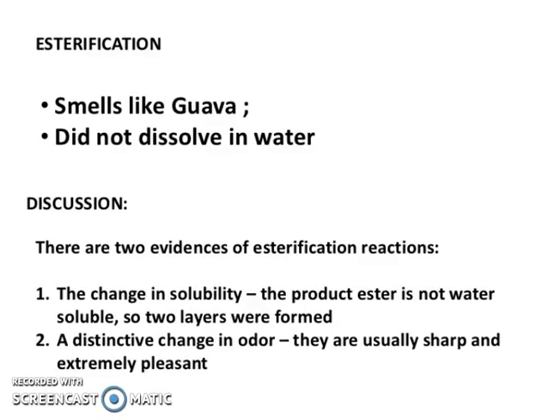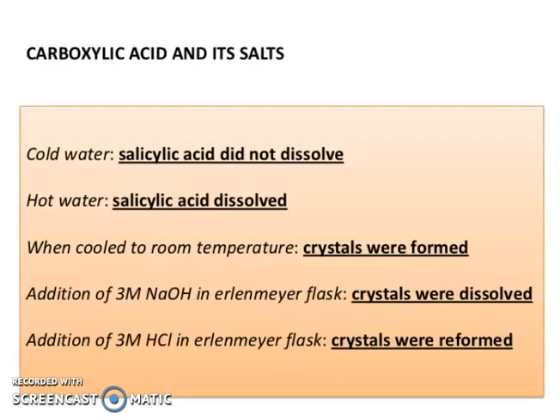So, esterification smells like guava, did not dissolve in water. Discussions. There are two evidences of esterification reaction. The change in solubility, the product ester is not water soluble. So, two layers were formed. A distinct change in odor, and they are usually sharp and extremely pleasant.